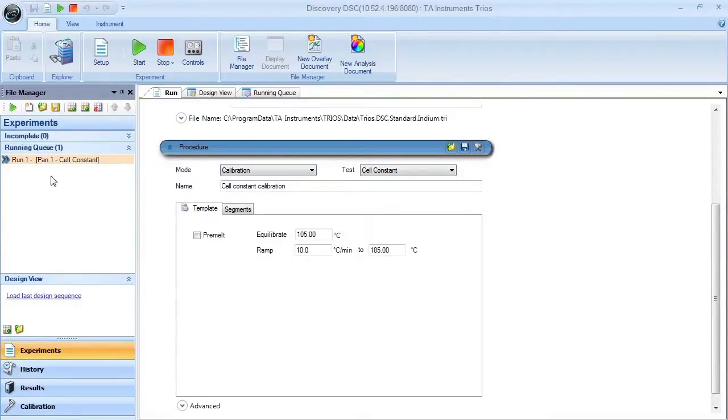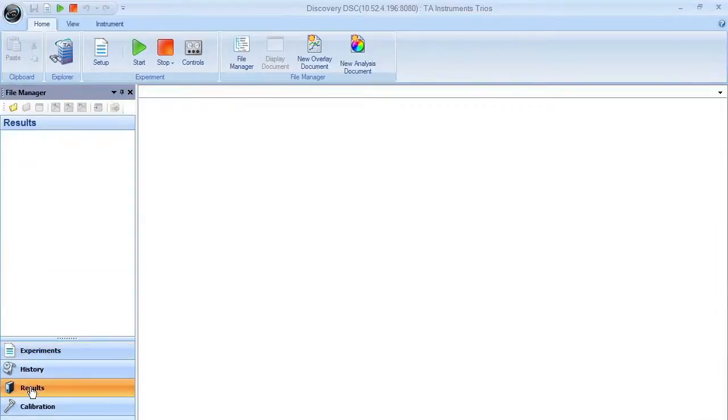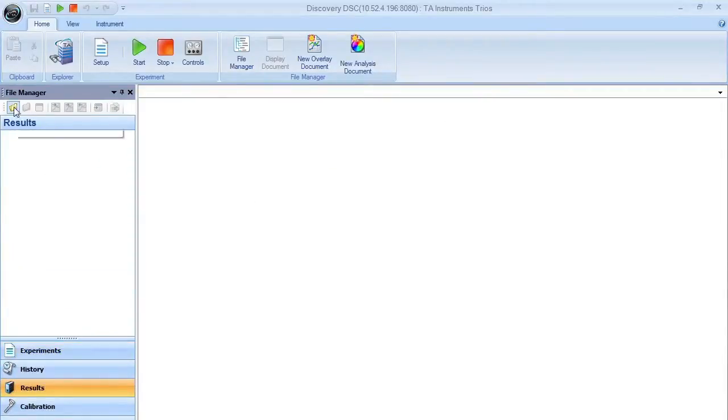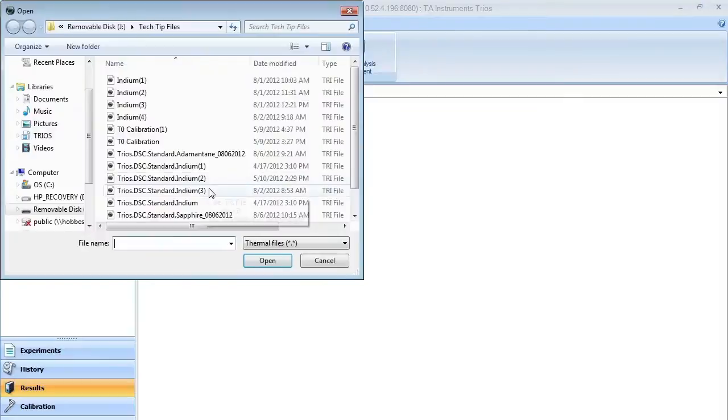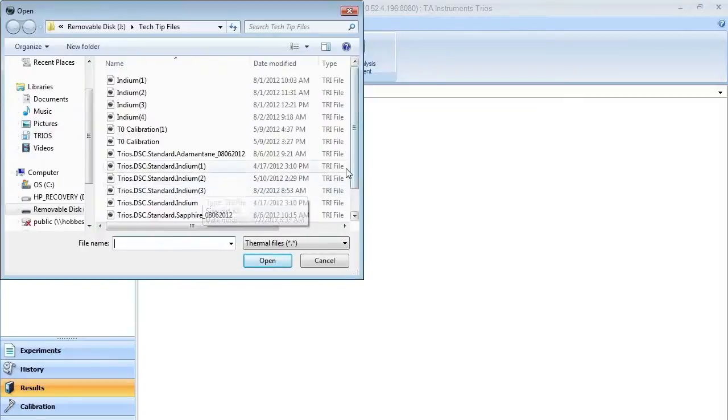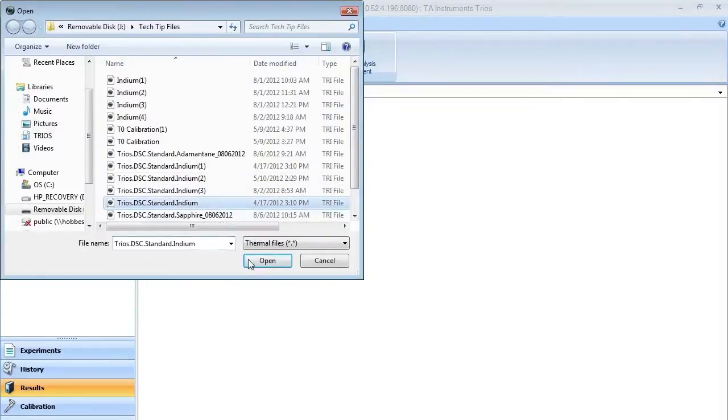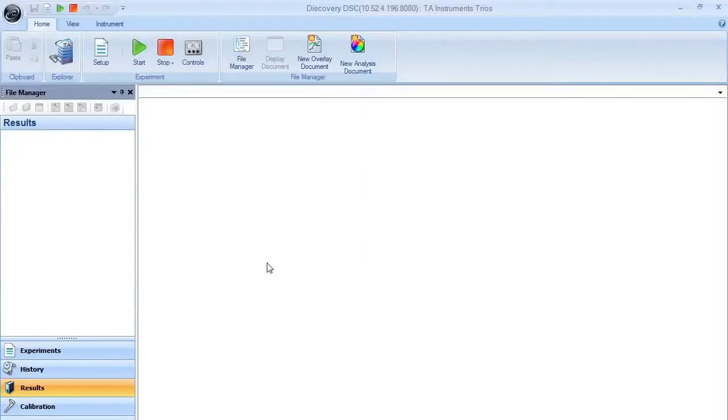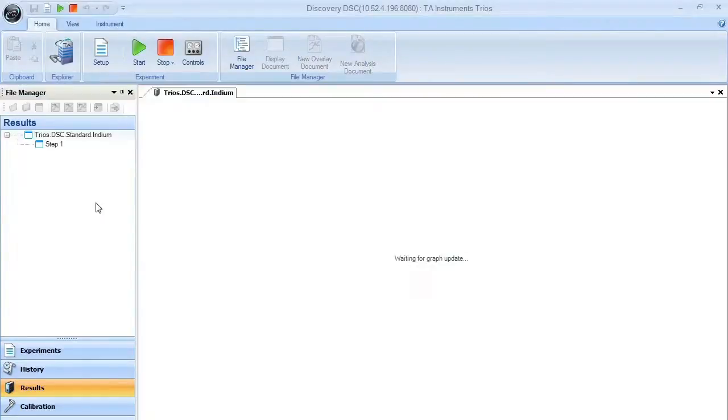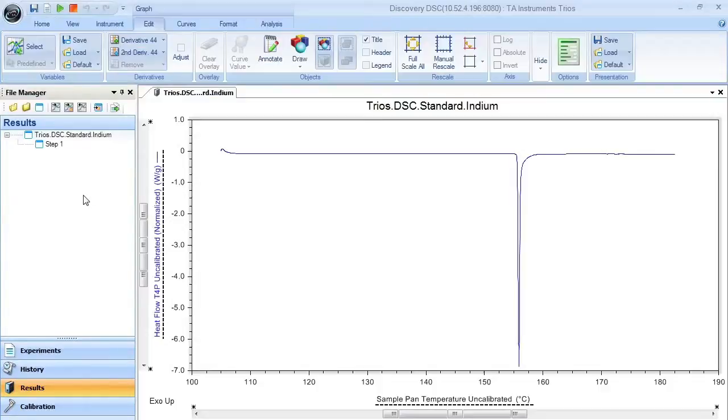Once the indium is run, it should automatically open in the results pane. But if not, you can open up that data file. In this case, we will run indium, open up the data file, and it should plot out the data according to the calibration parameters.